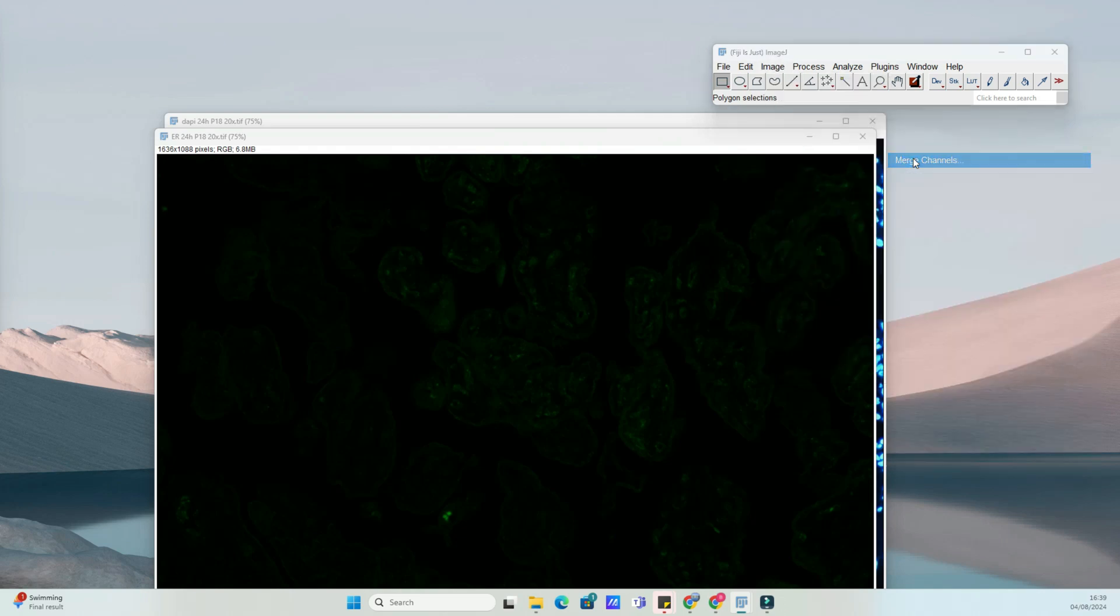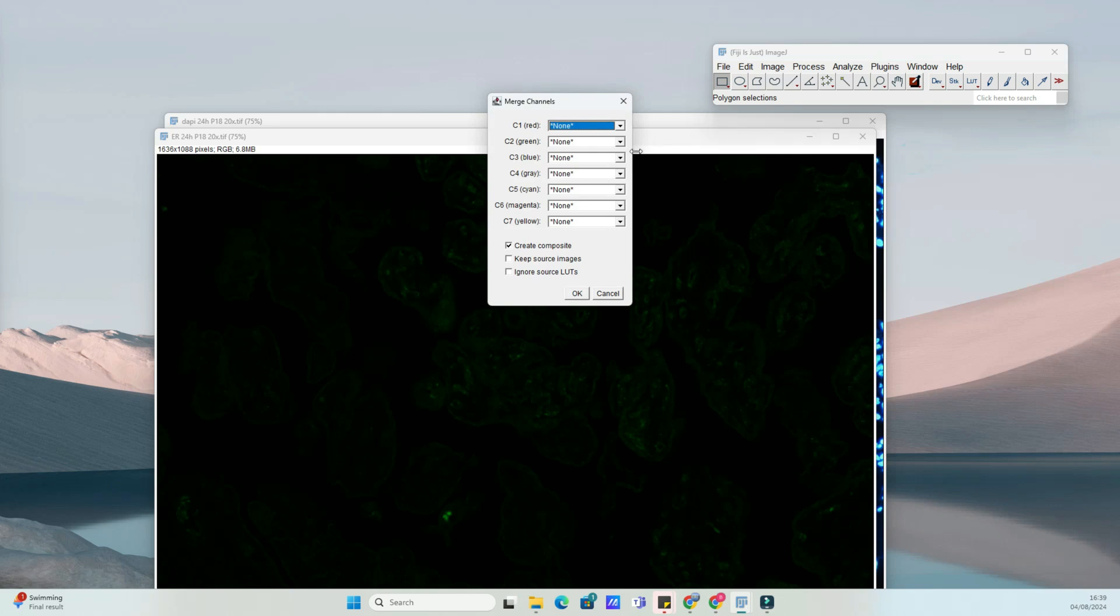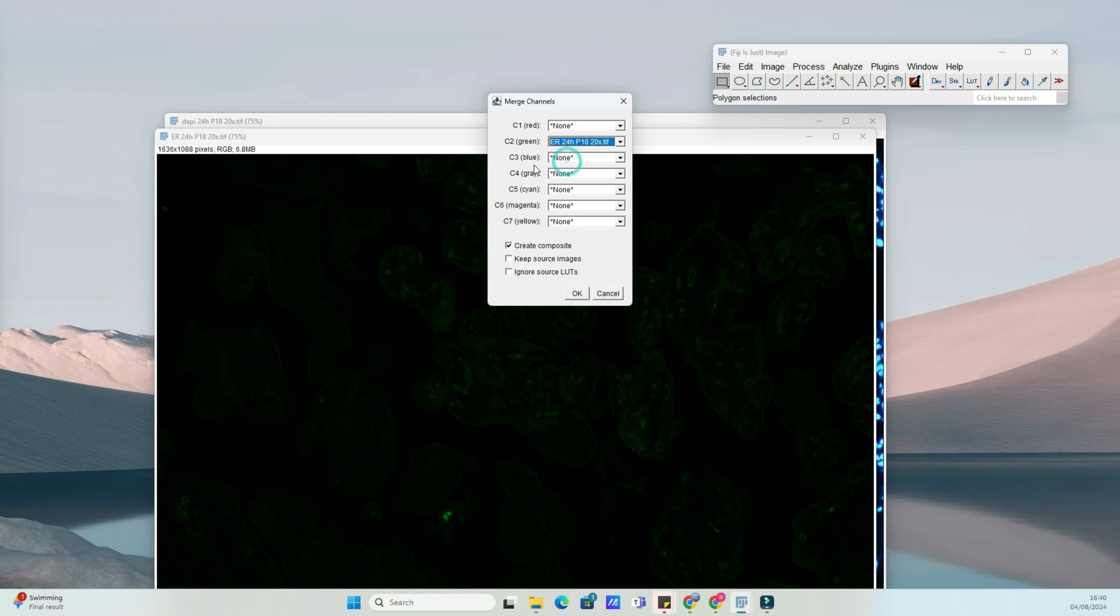Now open the images you want to merge. Go to File Open and select your different color channel images. In this tutorial, we'll use two DAPI and green channel staining images.